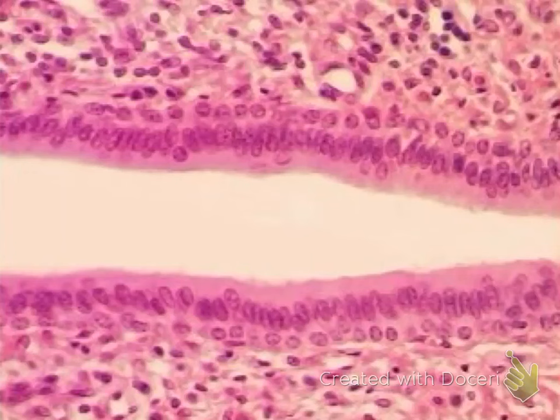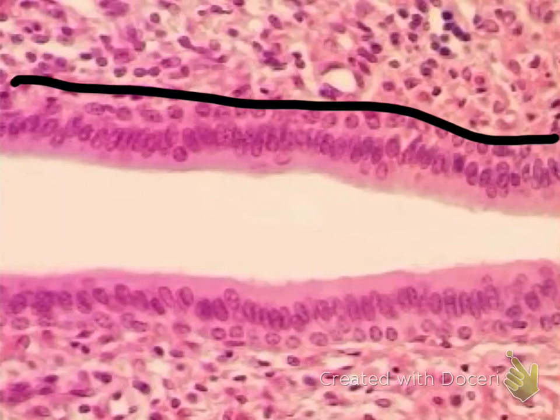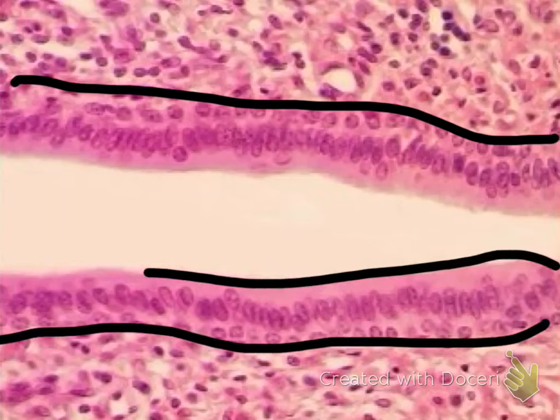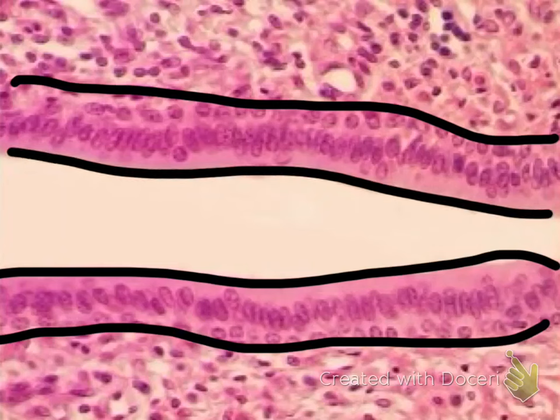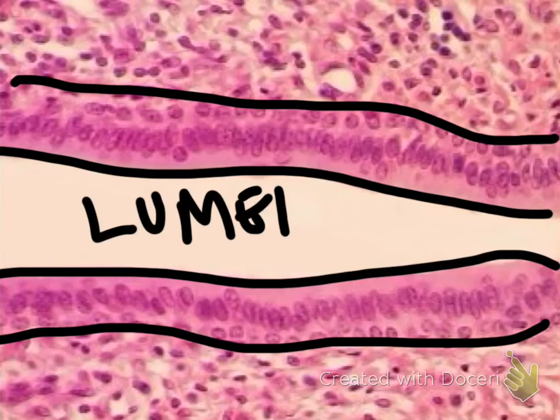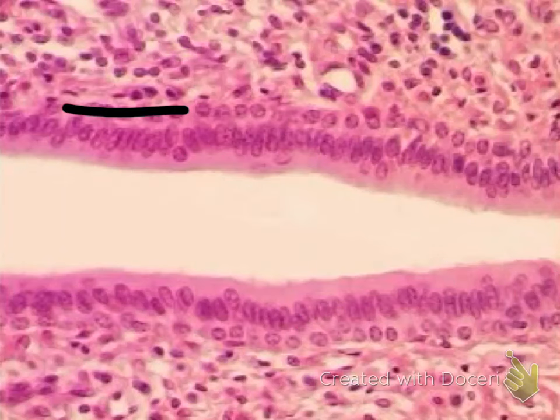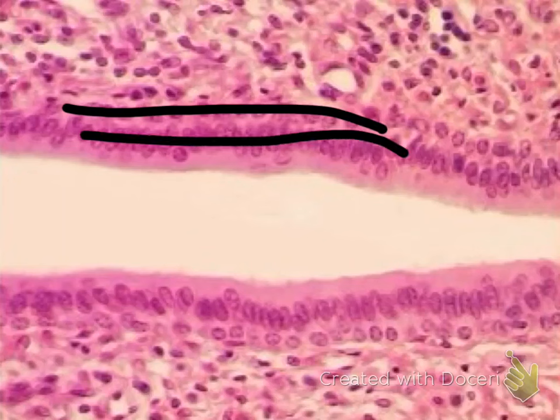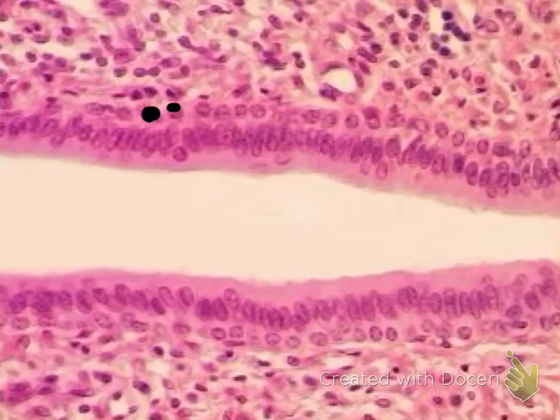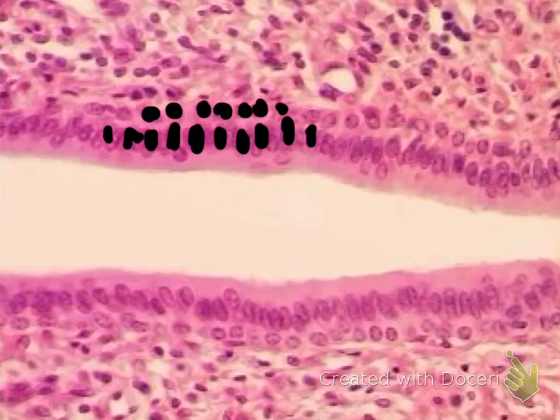Basement membrane. Apical surface. The space inside the organ is your lumen, and this is your epithelial tissue. Notice that there are two rows of nuclei — two rows means two layers, which means it's stratified. Notice that the cells near the basement membrane look cuboidal, but when you look at the top layer closer to the apical surface, the nuclei are oval-shaped, so the cells are tall. Multiple layers of tall cells — this is your stratified columnar epithelium.